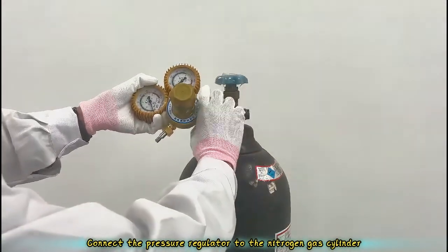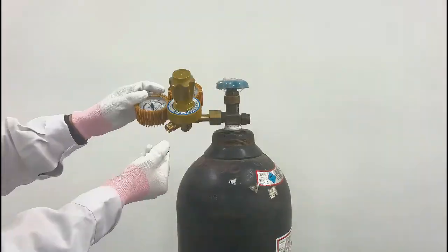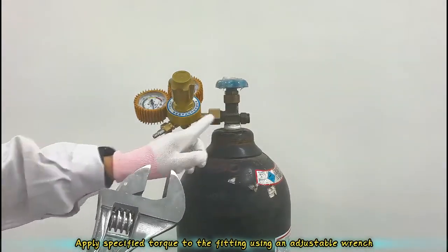Connect the pressure regulator to the nitrogen gas cylinder. Remove the pressure regulator fitting from the accessory kit. Connect it to the regulator outlet port. Apply specified torque to the fitting using an adjustable wrench.